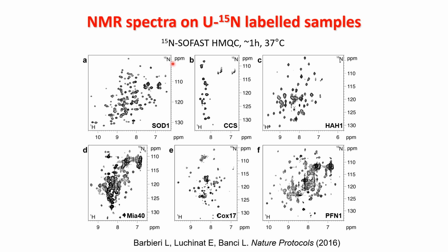Now CCS is an interesting case because actually CCS is a large folded protein. However, the only signals that you see are these few signals arising from unfolded loops. That is because CCS is one of those proteins that interact strongly with other cellular components. And that's a perfect example to show what happens when your protein is not tumbling anymore like a real solute, but it's actually sticking to something in the cells. All the signals arising from the folded protein disappear.